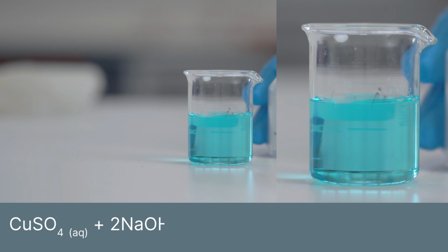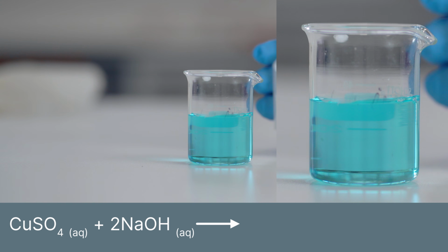And now I'm going to add the sodium hydroxide, which is very much transparent like water. And then I want you to have a look very closely at what happens.